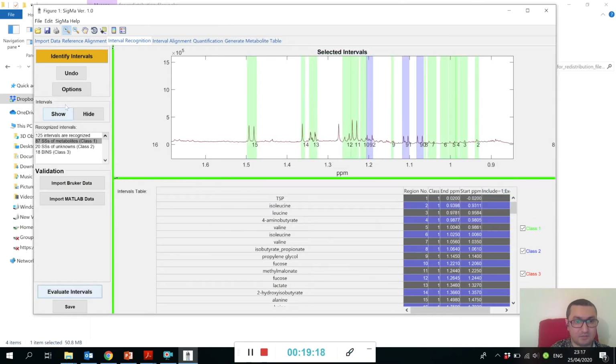So if you are happy with this mapping, then you are welcome to accept. If not, please go back to the options and redo it. You can also undo this mapping, change the options, and do it again. Here we also included something called the validation box.